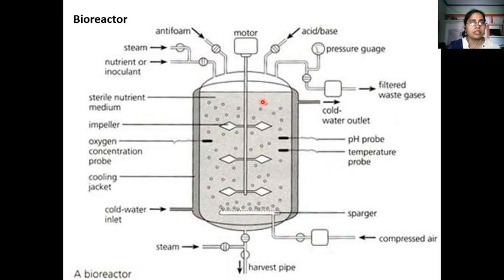So next is the most important, it's an inlet. From that, nutrient or inoculant is added here. Clear? So this is the antifoam. From that inlet, we are adding antifoam.